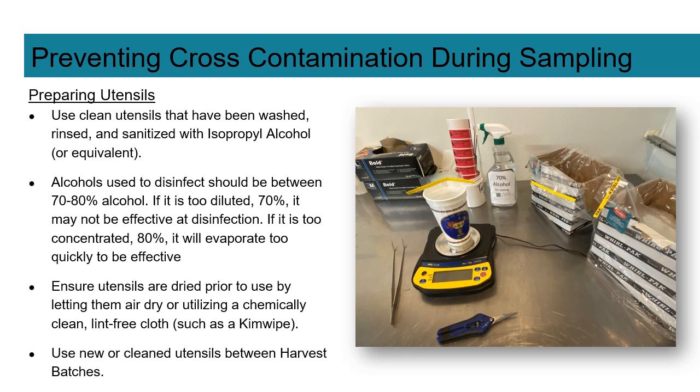Ensure utensils are dried prior to use by letting them air dry or utilizing a chemically clean, lint-free cloth, such as a Kim wipe. Use new or cleaned utensils between harvest batches.